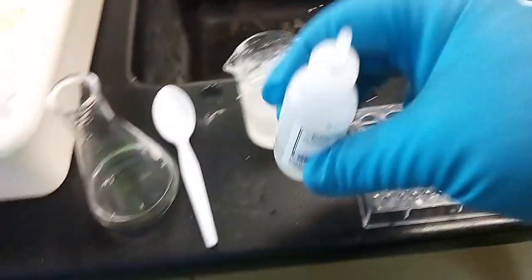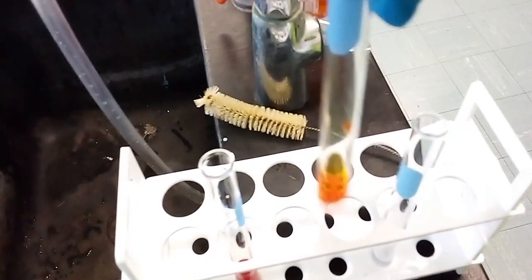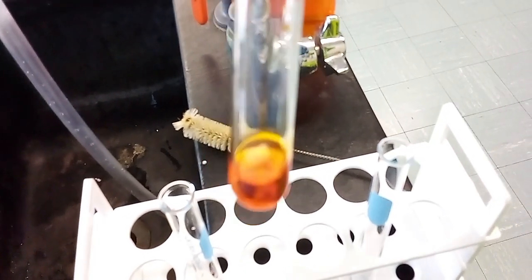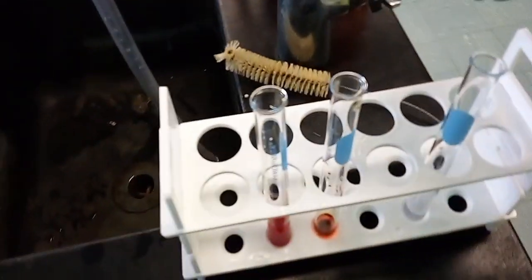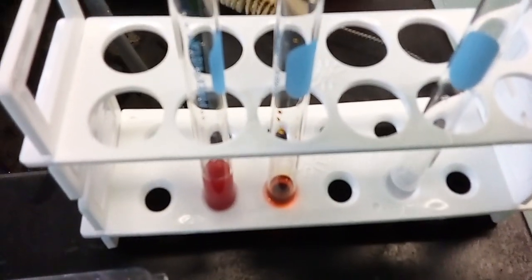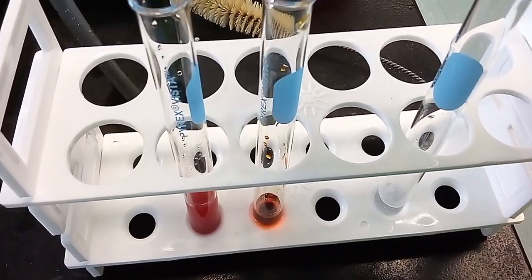Right there. Let me mix the test tube. One of the drops just got there. So you can see that it's turning very yellowish. Let me see if I can add a little bit more in here. I don't want to add too much.